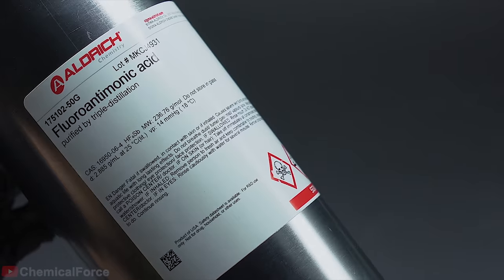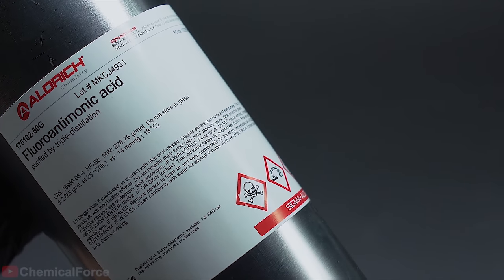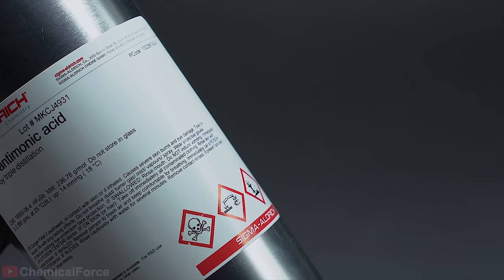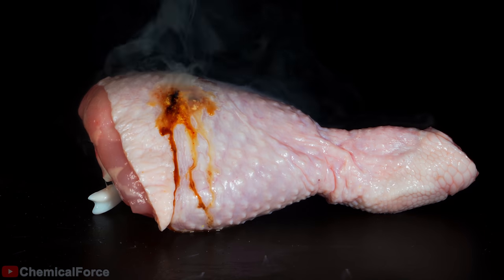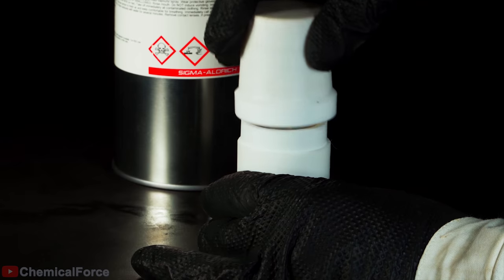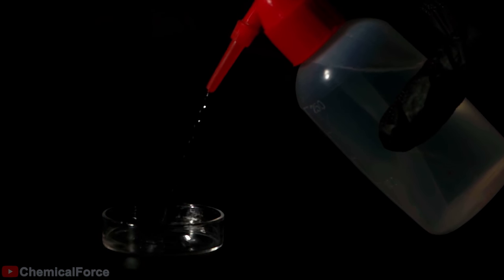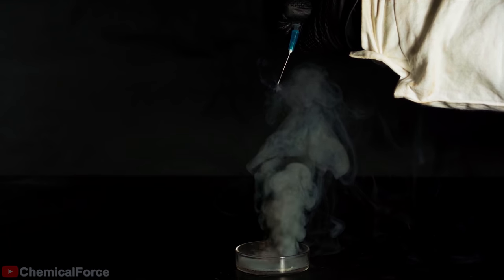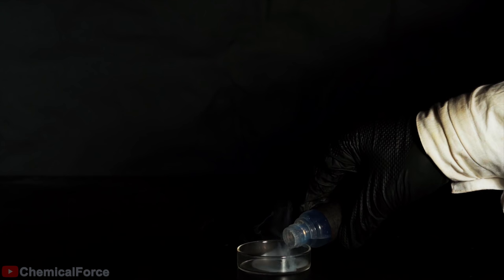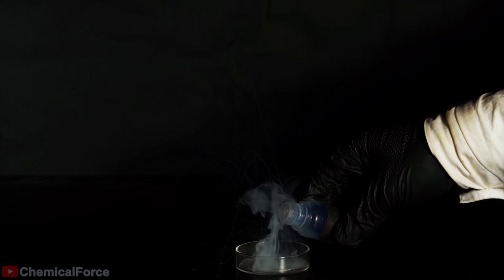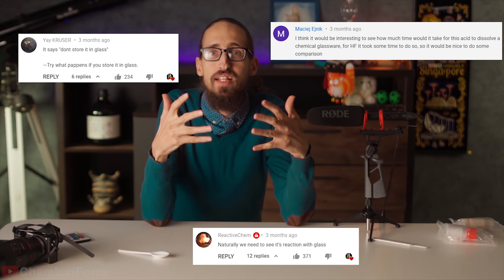In this video we will bust all the myths about this chemical and find answers to questions like: what will happen if this acid gets on your skin? Can it really be stored in a Teflon container only? Does it explode in contact with water? How does it react with strong bases? Is it true that it dissolves glass quickly? And starting with the last one, I'll tell you that it doesn't.